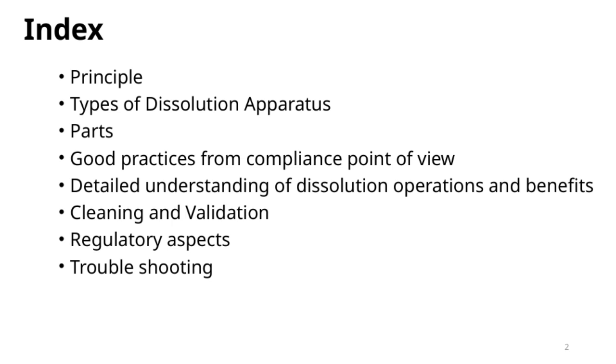Troubleshooting is inevitable, and we'll look at common issues that can arise during dissolution testing and how to resolve them efficiently. Finally, we'll reference the overall index of topics we'll cover, tying everything together to give you a comprehensive understanding of dissolution testing, its importance, and how to execute it effectively.